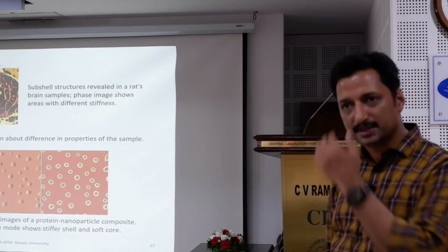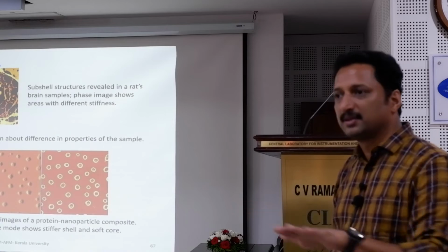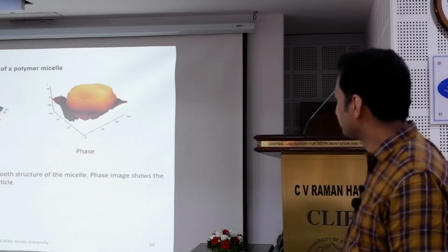Okay. Slow scan means it will tell you how many pixels per second, and you just vary it and see whenever you are getting a good image. Okay, all those things I hope will come in the hands-on session.